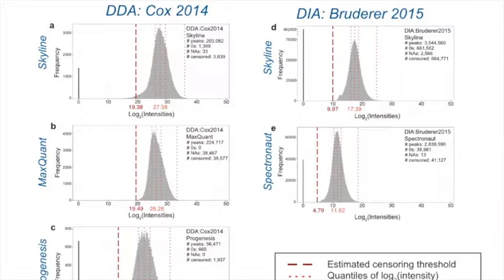we don't trust the values. Unless the tool tells us that there's a difference between censored and missing at random, we will always assume that it is censored, because it is more common, essentially. So here, for example, those 33 NAs, we will leave them NA because we know that they're not censored. But for everything else, every value below the cutoff, we will assume that it's low abundant analytes, and the numbers we do not trust. So that's the idea.